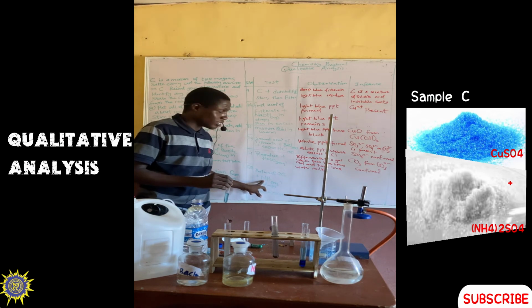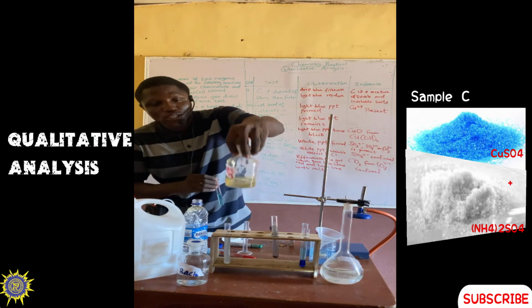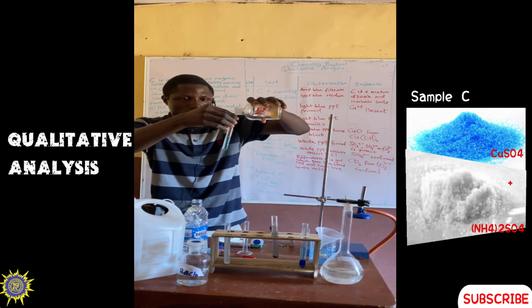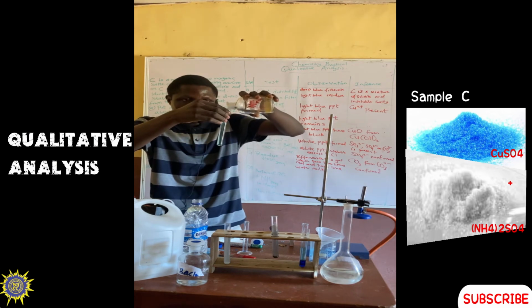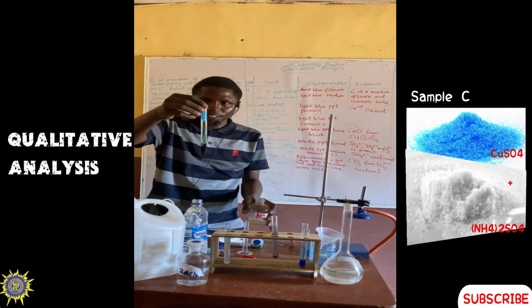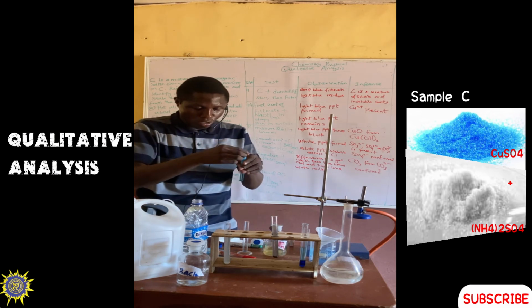Aqueous sodium hydroxide. This is aqueous sodium hydroxide here, in drops. So we have it in drops. Now I have a blue precipitate. If you add it, we are going to have a blue precipitate form. Now there's a blue precipitate formed in drops.